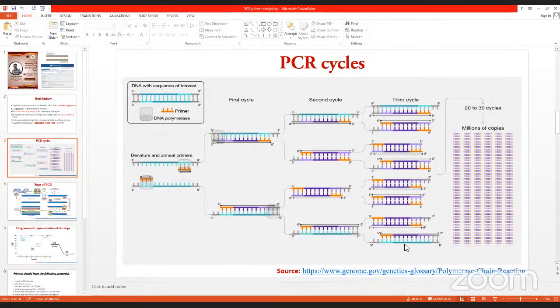Suppose I have taken maybe a human genome, maybe a mouse genome, or maybe a rice genome. I have extracted the whole genome by a DNA extraction method. This is the initial stage one molecular biologist does.